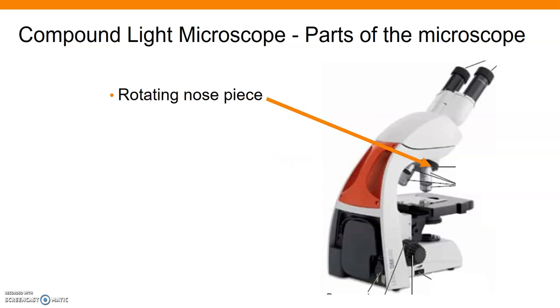The other parts of the microscope include the rotating part that is going to hold the objective. This is called a nose piece and it does rotate. These objectives here will rotate so you can move them around so you can focus on different magnifications.